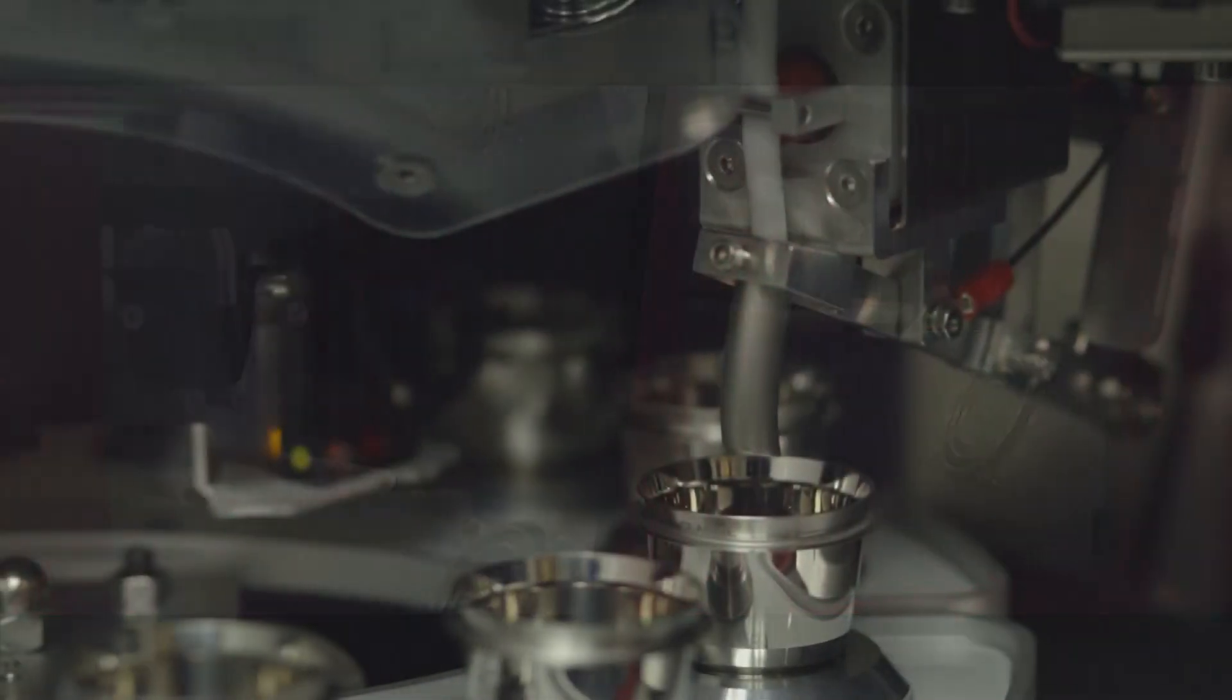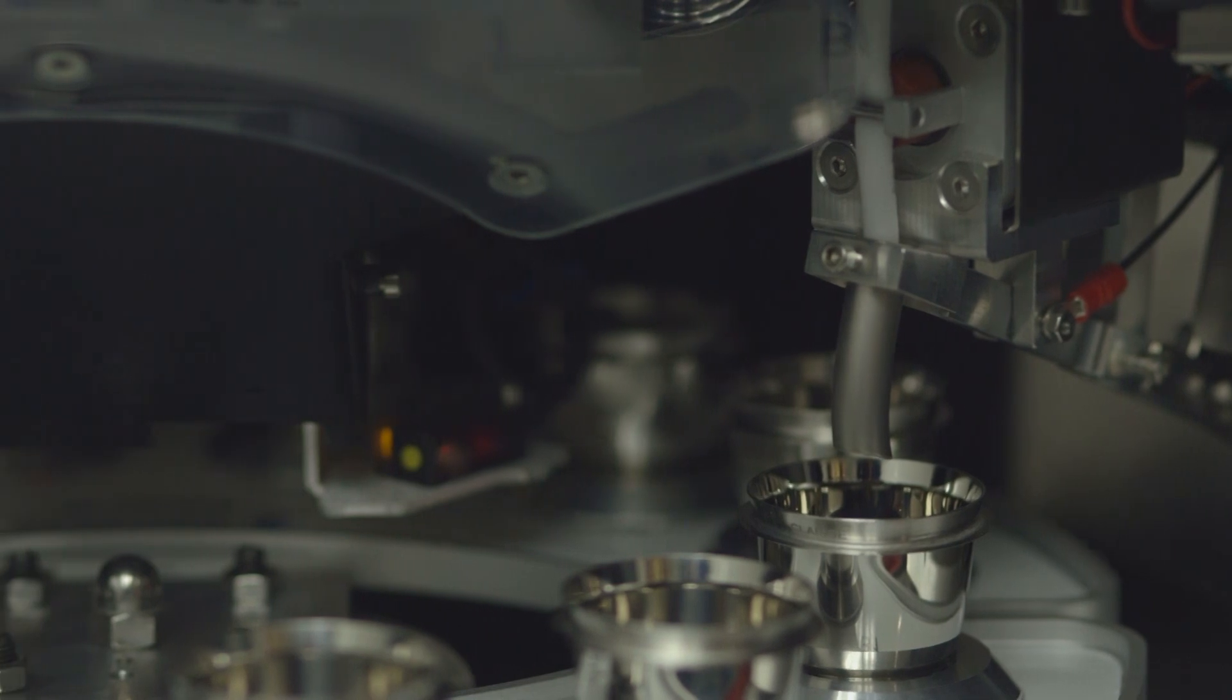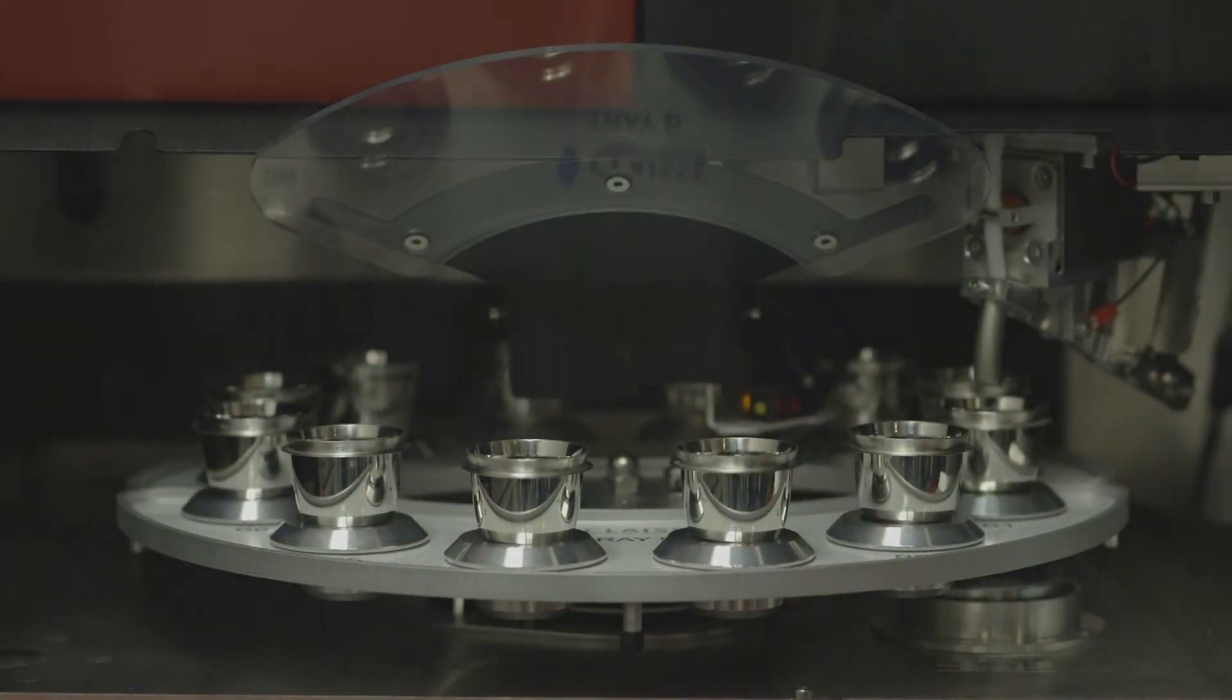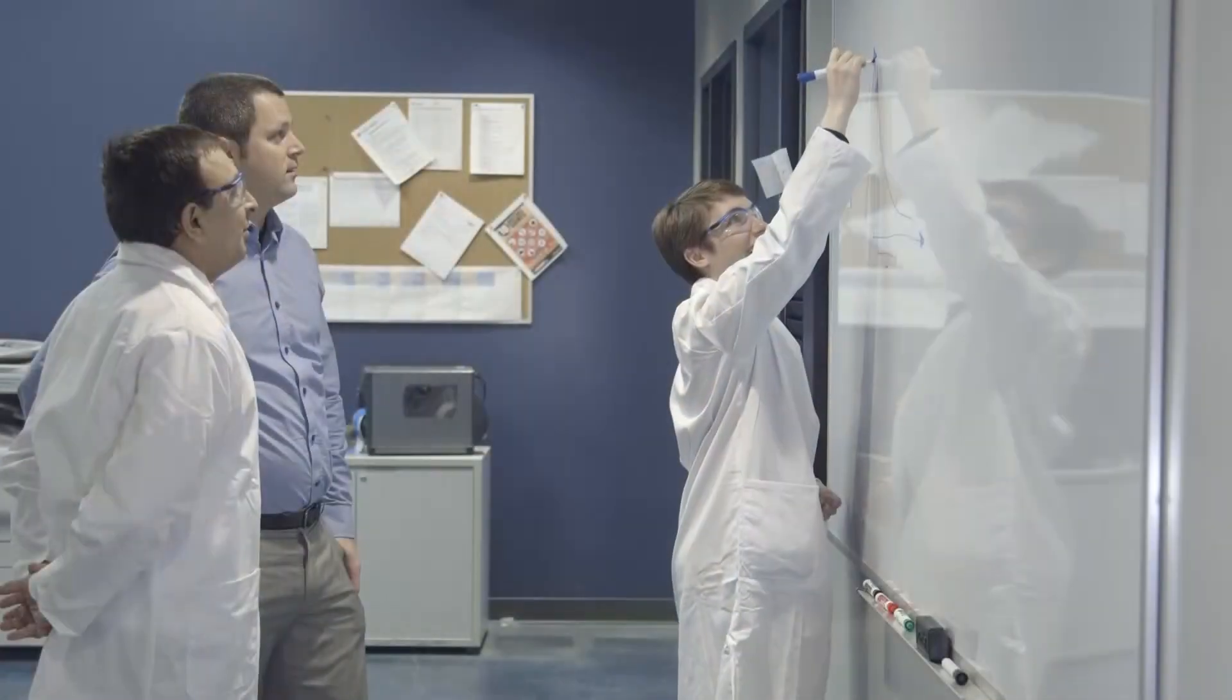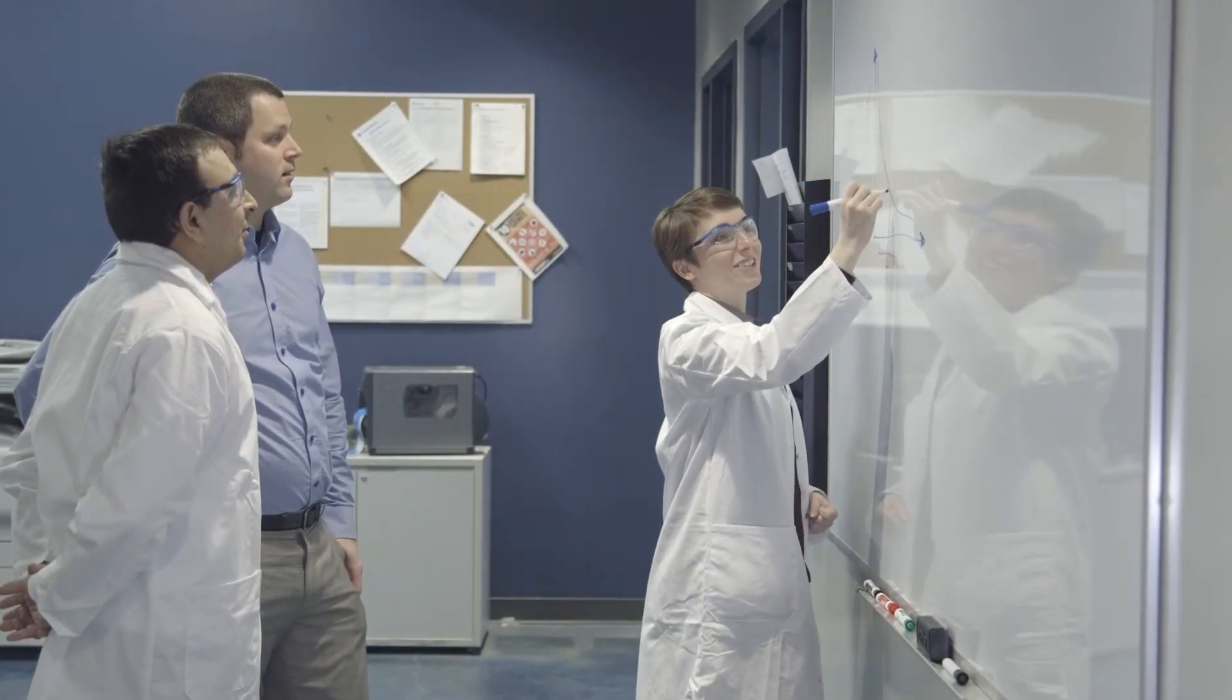We anticipate customer needs and innovate in the development of high performance products and services. Our strength is our people, and thanks to them, we've maintained our position of world leaders in sample preparation by Fusion for the last four decades.